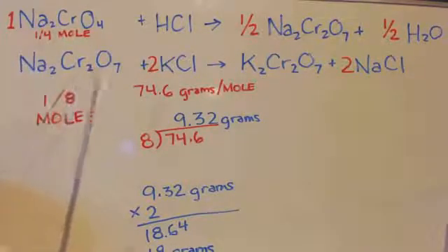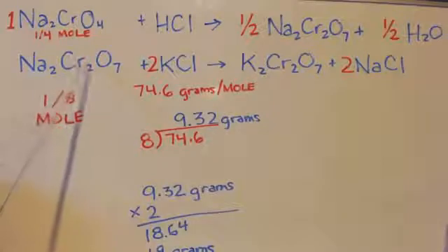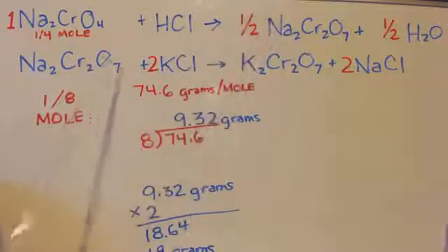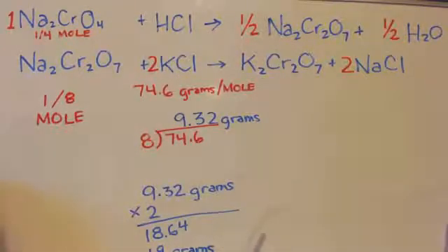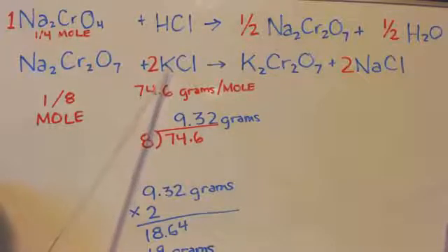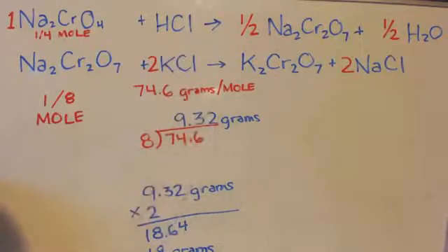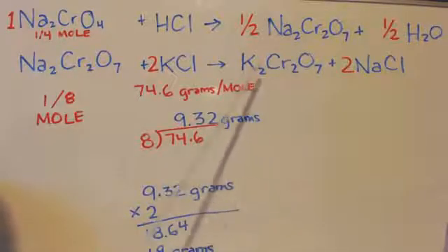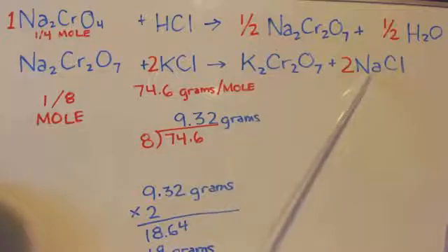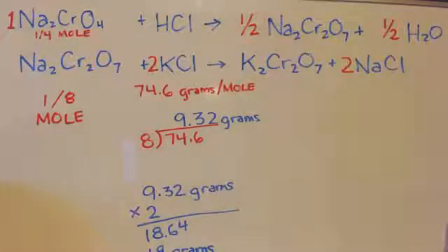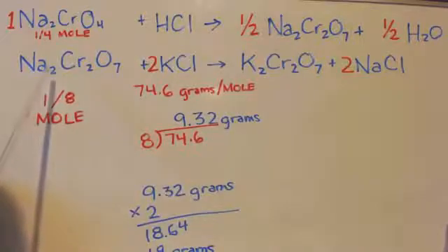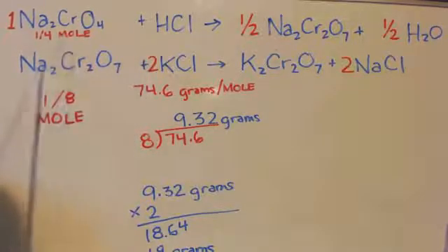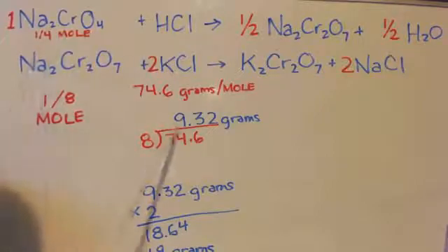But anytime you boil it and then put the potassium chloride in and then cool it down, now other stuff like the sodium chloride, a couple grams of that can precip out too. Now when I added my potassium chloride, the sodium dichromate was saturated but it was at room temperature. There was nothing, no particles in it, no precip. But it was at room temperature and I put the potassium chloride in and almost immediately I got precip. I put it in the refrigerator and I got 20 grams out.